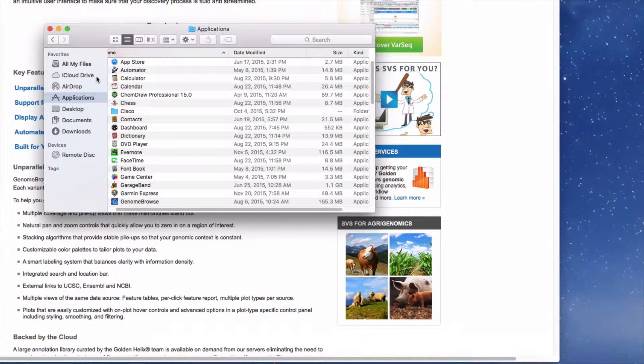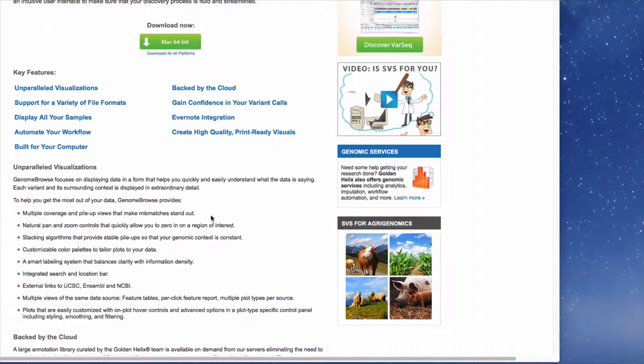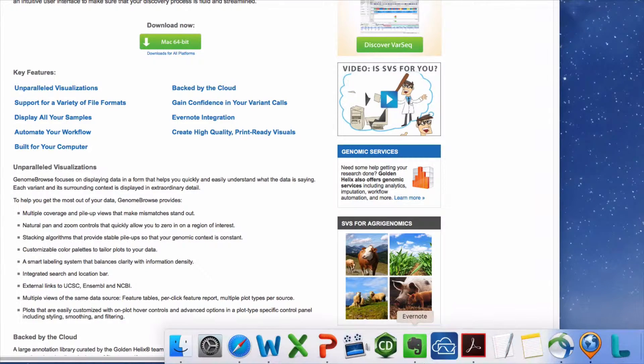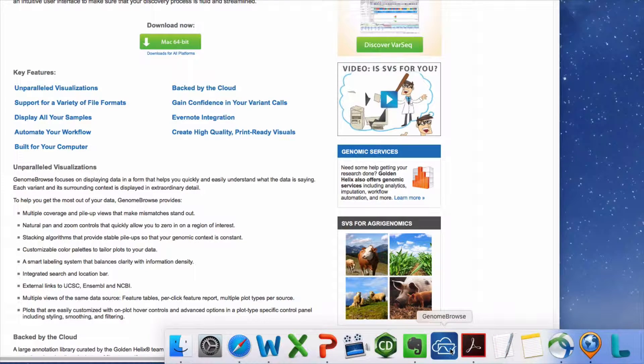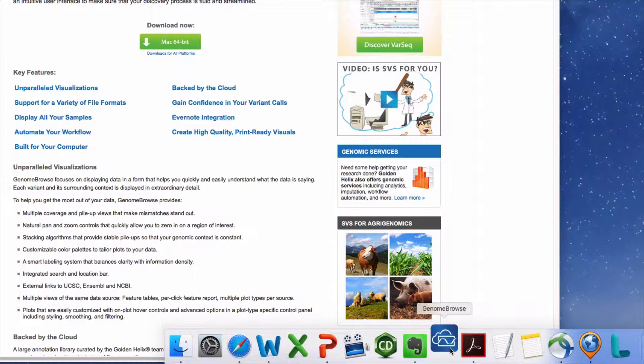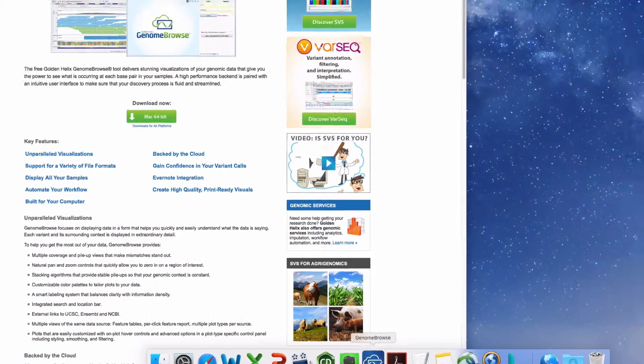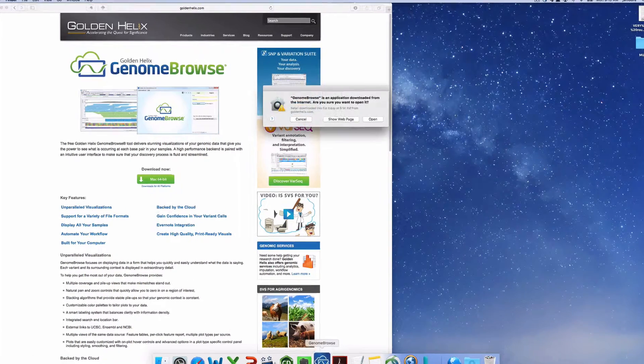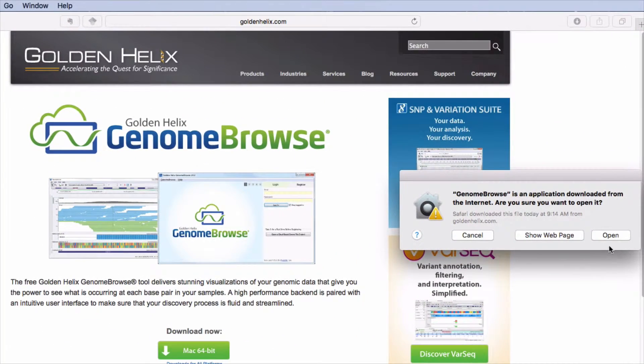Close the Applications window. Double-click on the Genome Browse icon to launch the application. Genome Browse was developed by a trusted source. Click on Open.